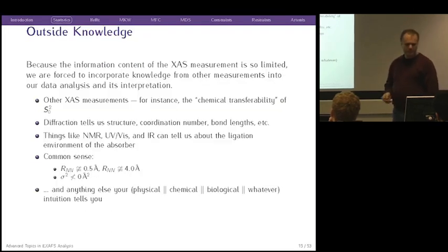Now there's also all kinds of outside knowledge that we use to understand our XAFS data.